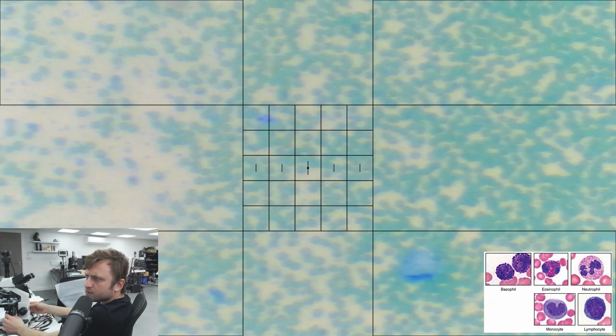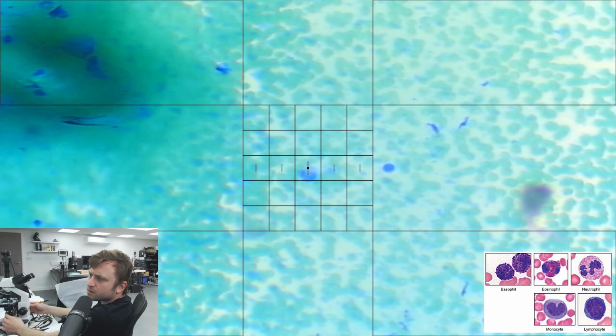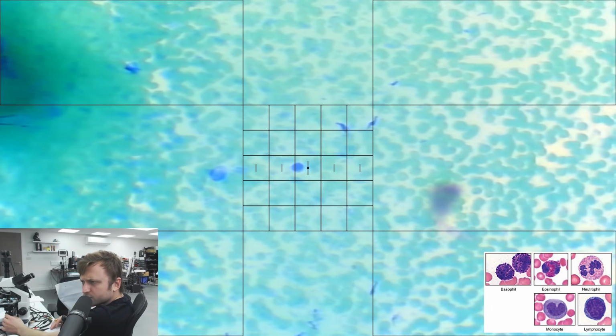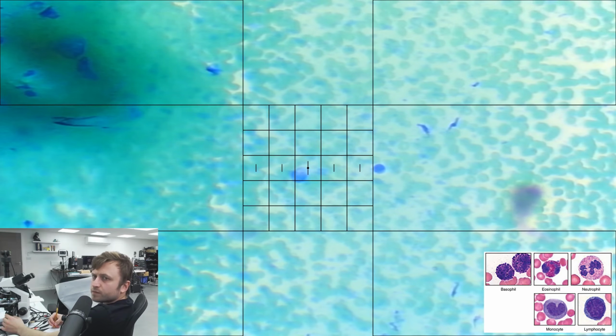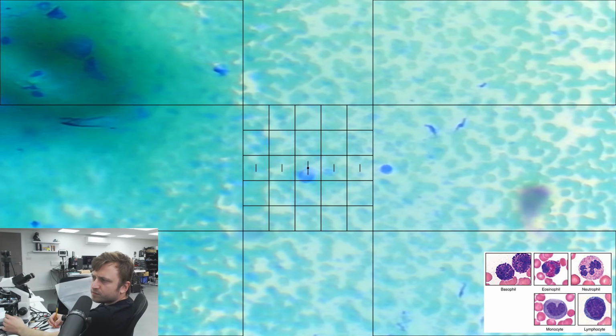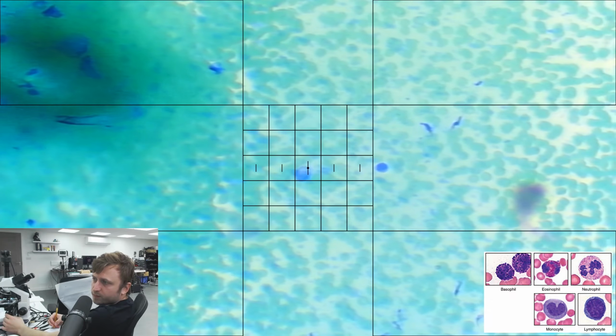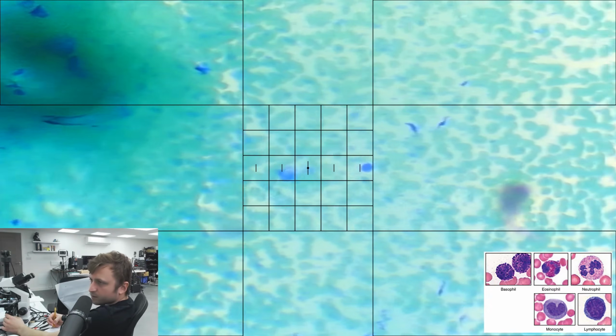Lymphocyte, that's clearer. Neutrophil. And back in we go. Lymphocyte, unknown. Or monocyte, hang on. This one here, under the A marker, again, larger cytoplasm maybe? If it is one, and not just a visual anomaly. And then I'm thinking kidney bean shape. I'm going to mark it as a monocyte, even if it's wrong.